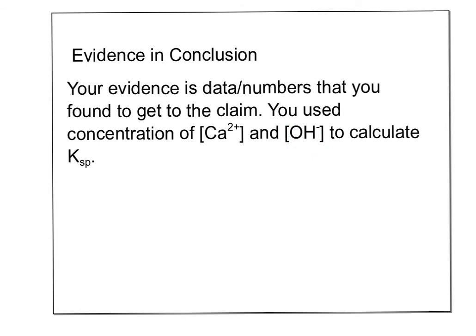your evidence. Some of us did not include numbers at all in our evidence, and some of us tried to include every single number. I measured this much acid, and I added this much water to it, and I added 1 drop of phenol. No, don't tell me every number. Just tell me the most important numbers.